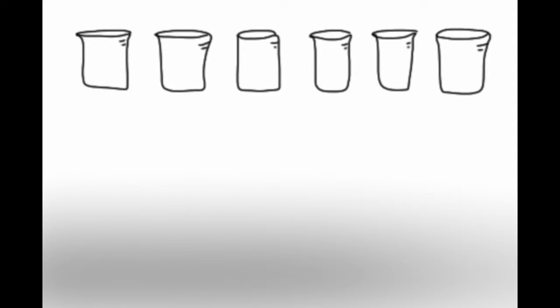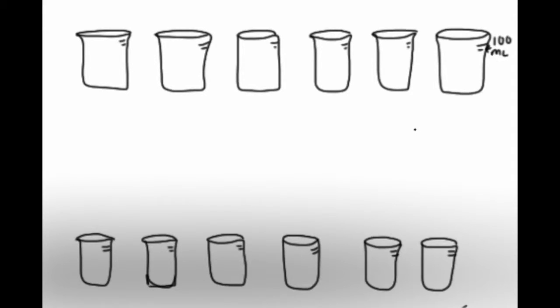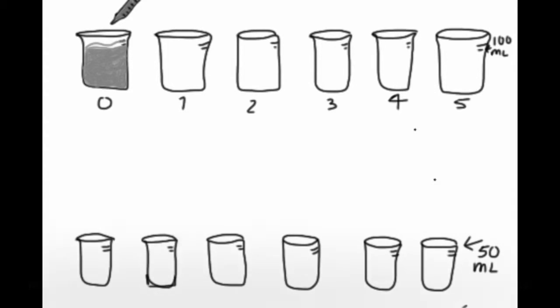Take six beakers that can hold up to 100 milliliters and six beakers that can hold up to 50 milliliters. Label the first set of beakers 0 to 5. Fill beaker 0 with 100 milliliters of 1.0 molarity hydrogen chloride.